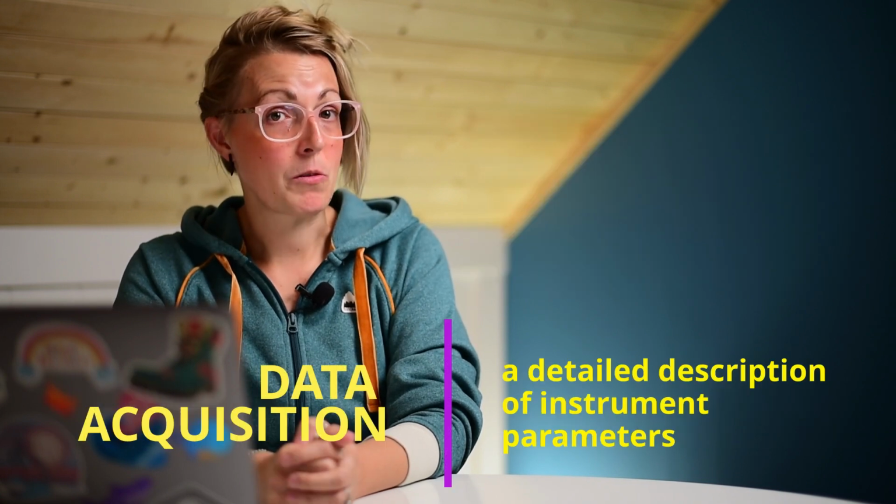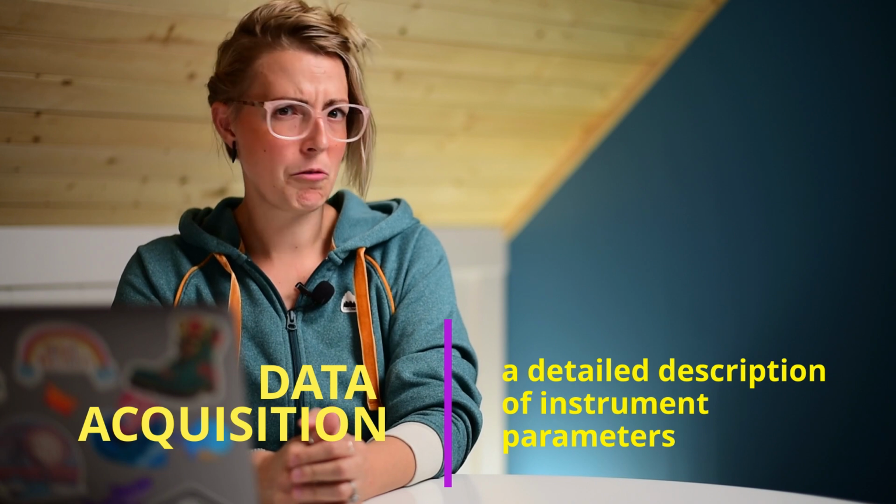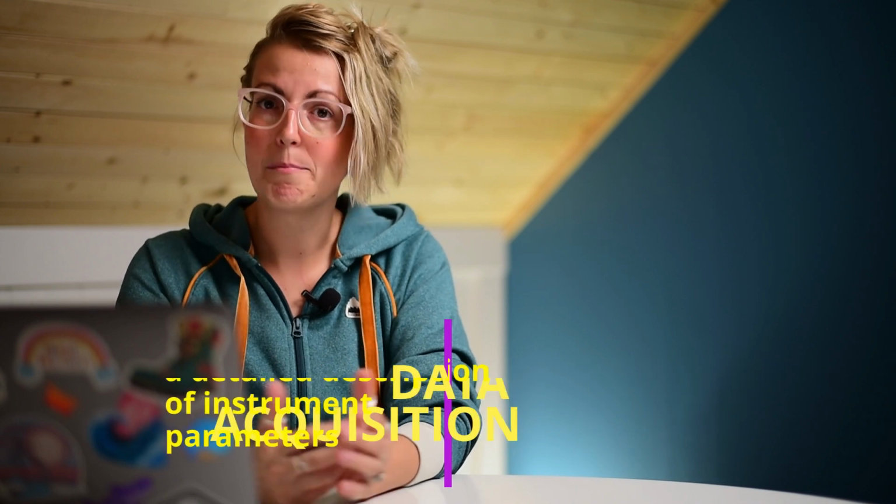Next up is data acquisition. You might find in a lot of papers you read that this area will be severely lacking. Most of the time, you will see just the name of an instrument given, or it might just say, these samples were acquired on a flow cytometer. This does not give you enough information to go back and reproduce this.